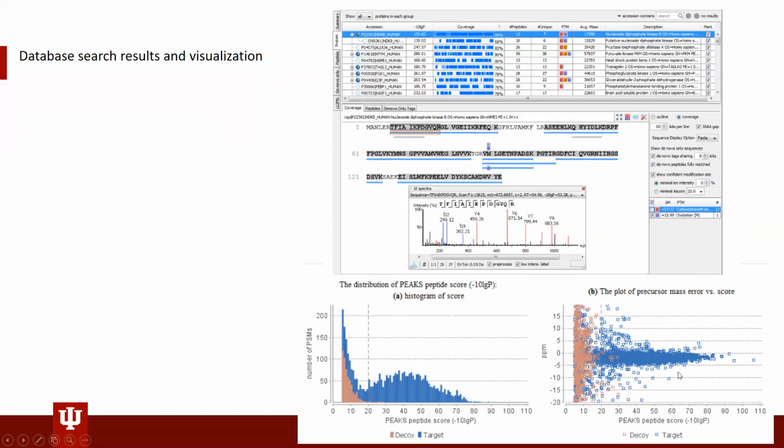Down here is this histogram. So this is directly showing you the target decoy and how the false discovery rate was calculated. Obviously the false discovery rate is designed so you have as much positive data with as few false peptides in your data as possible. So if you're having a cutoff of, say, 1%, you'll see this move around, and you can actually see the data change in the different views. So that's kind of nice because it's something you can really directly manipulate in the data view.